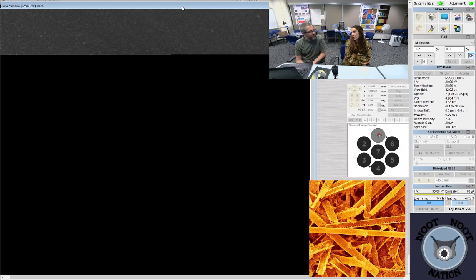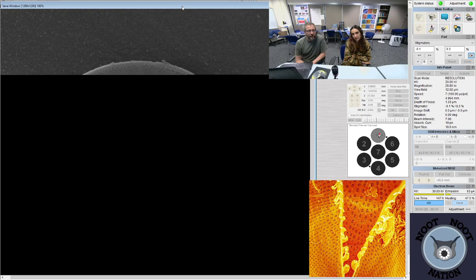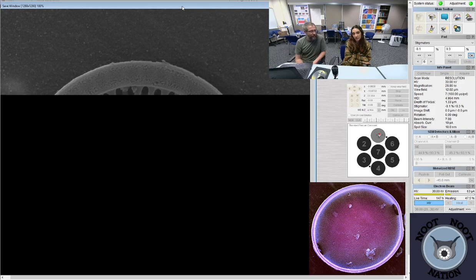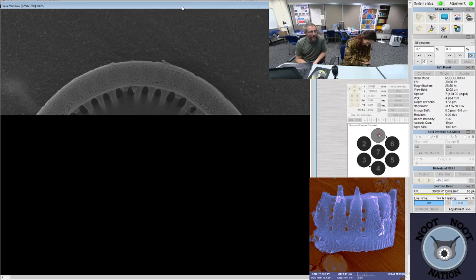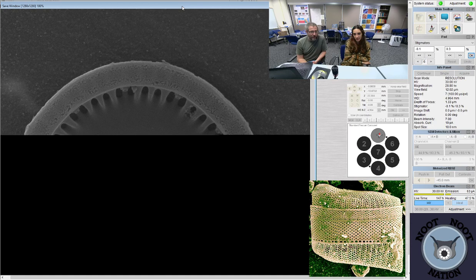Their cell walls are composed of silica. But inside the cell walls, where the diatoms, if they were alive, we would see would be filled with chloroplasts and cytoplasm and things that are made out of carbon. So we get rid of all that stuff because it blocks our field of view, for one. We can't see what we want to look at, which is the skeletons, which is how most diatom taxonomy is based on the frustule or the valve ultrastructure and the features that are present therein.